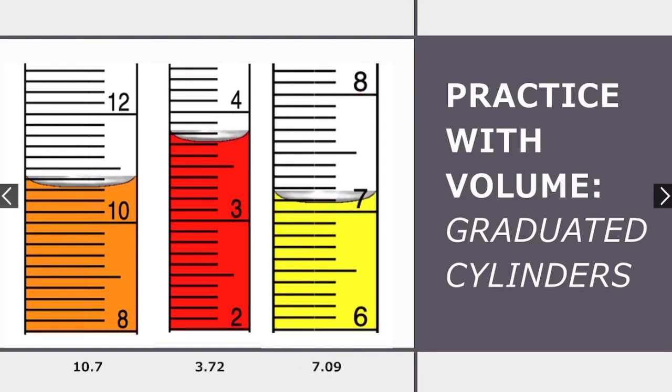All right, so those are the measurements I got, and I actually should have milliliters after all of these. We always want to include units on any measurement we take so that we know exactly what that number means.